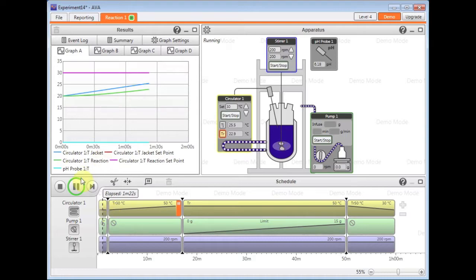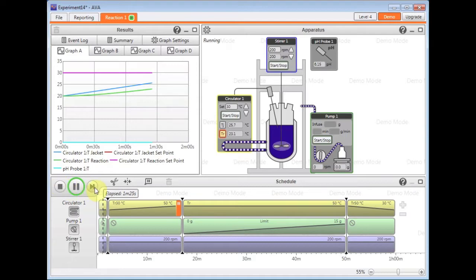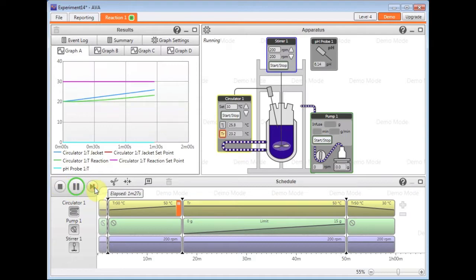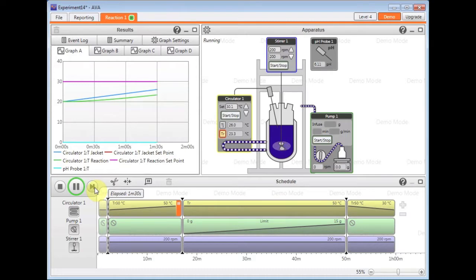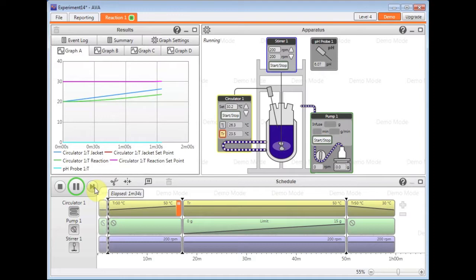I'm just going to show you the skip function quickly so you can skip through the schedule, and you can also make any changes that you like to any of the steps as it's running. So a very flexible schedule tool.